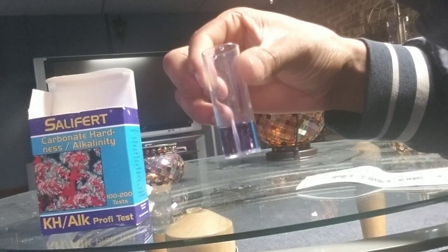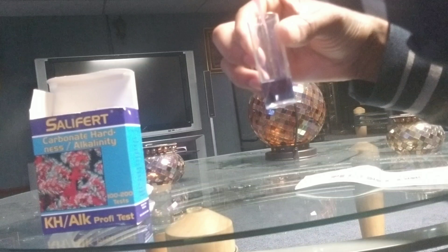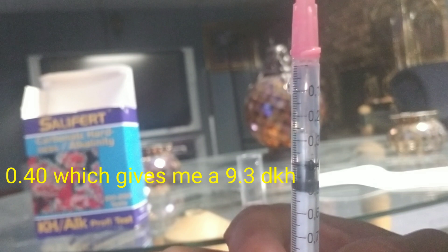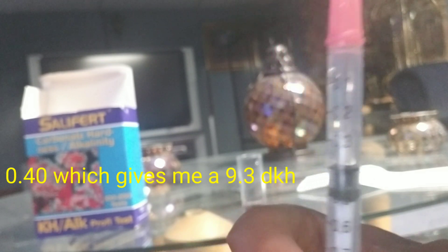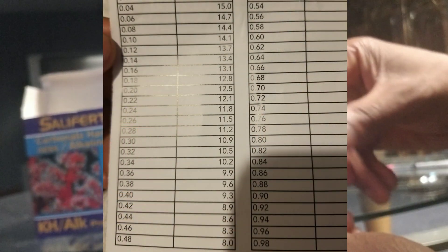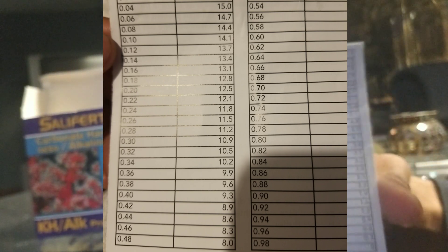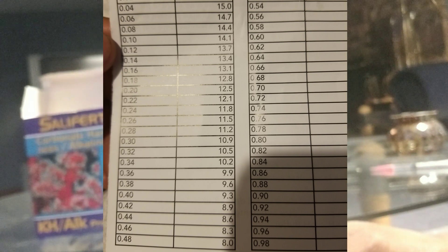It's starting to change a little bit. Right there I'm getting a light pink. On the syringe I'm at 0.40, which gives me an alkalinity of 9.3. You need to look at the test chart for your results — and it's that simple, that is it.